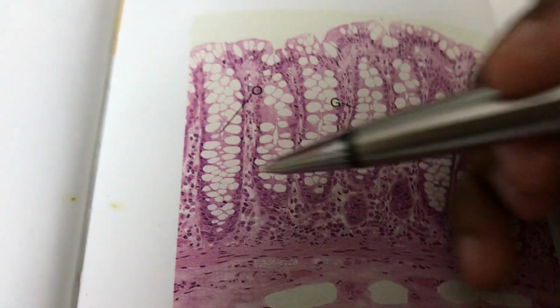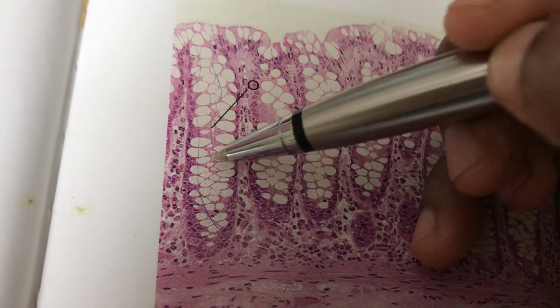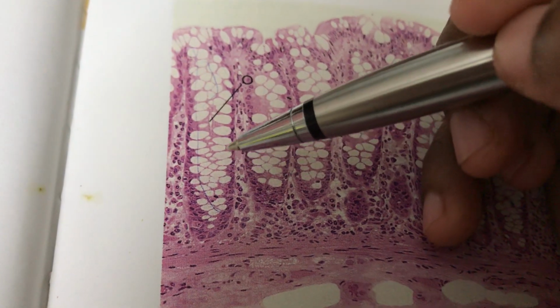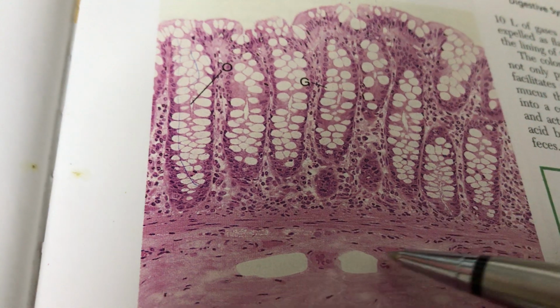Colon, you do not have the villus. Instead of that, you will be having the crypts, and crypts are full of goblet cells, you could see. And here we do not have the Paneth cells. That is the most important feature of the colon. You do not have the Paneth cells. So here the rest of the other layers are all same.